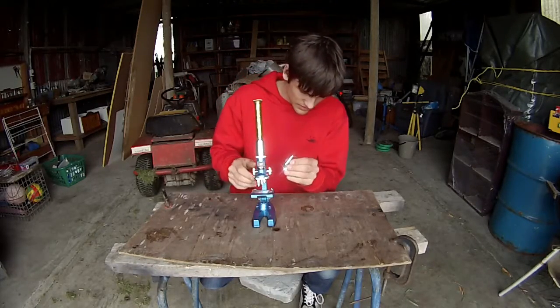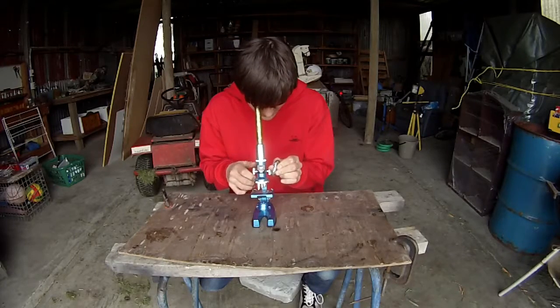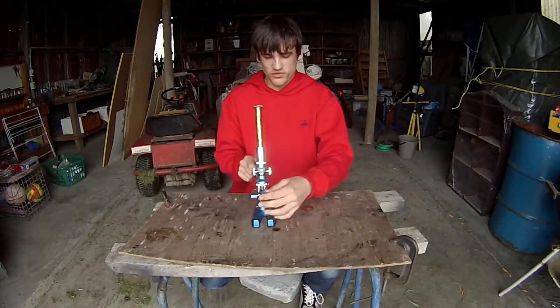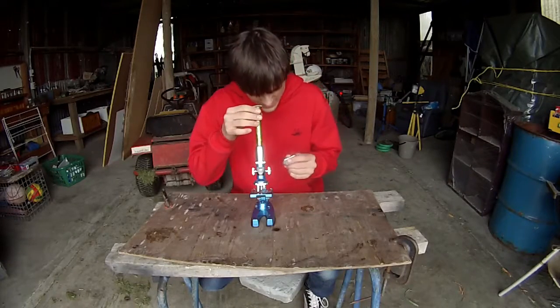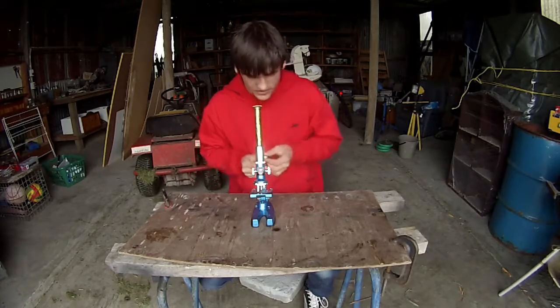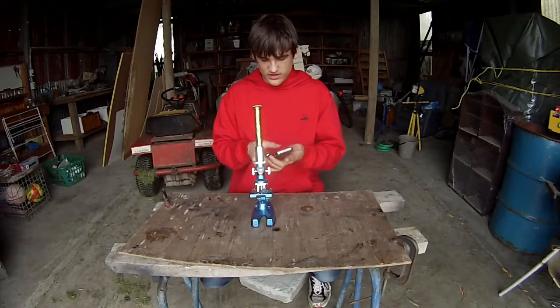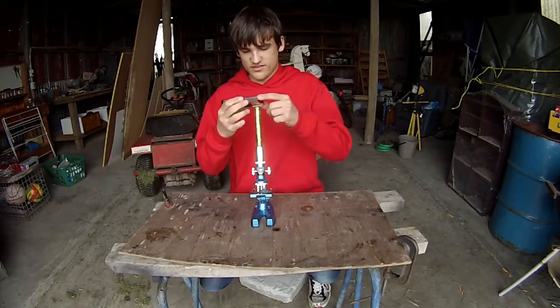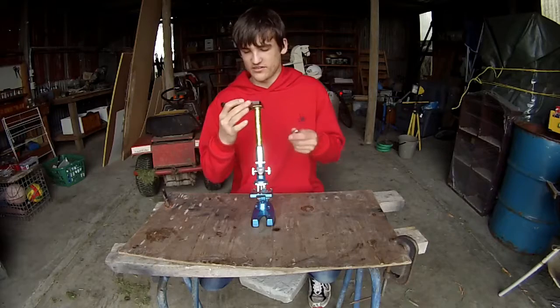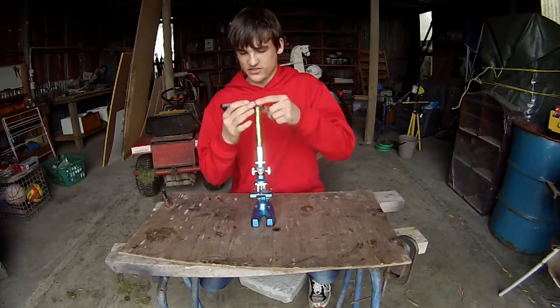So if I add the light and focus it up. And of course this is not professionally done so focusing is not going to get a clear image. But with my phone here, I'll give you guys a look at what I can see to the very best I can. It's really hard to film down a microscope with a phone.